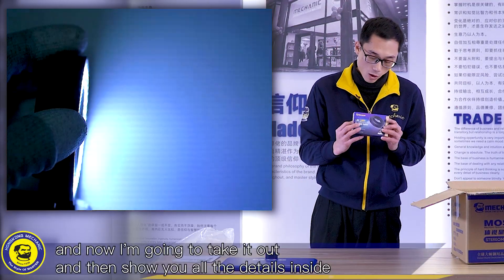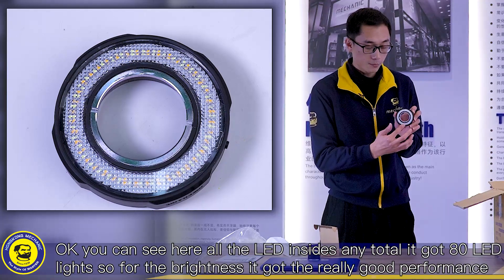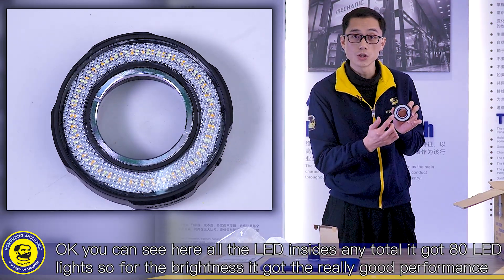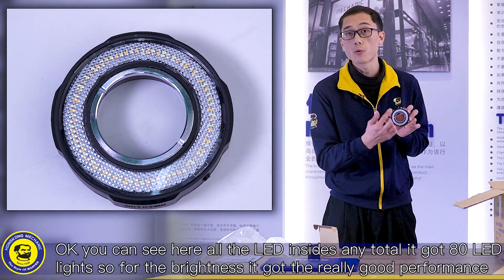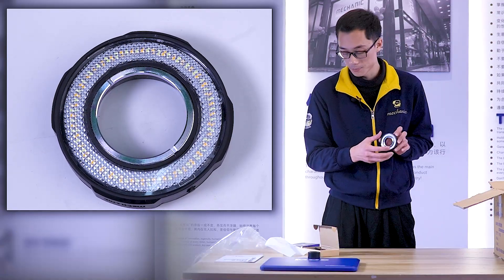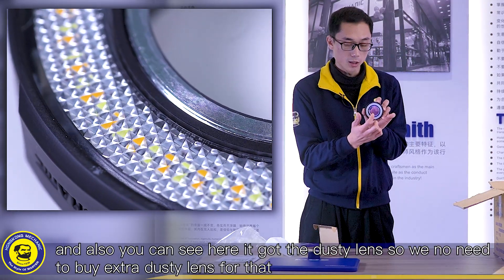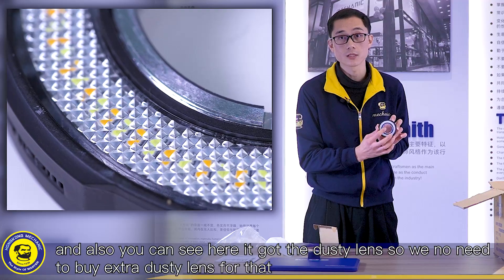Now I'm going to take it out and then show you all the details inside. You can see here all the LEDs inside — in total it has 80 LED lights, so for the brightness it has really good performance. And also you can see here it has a dust lens, so we don't need to buy an extra dust lens.